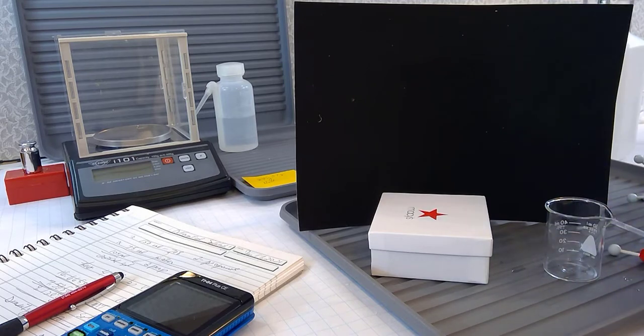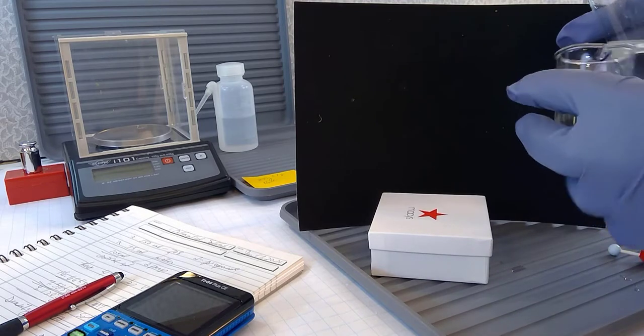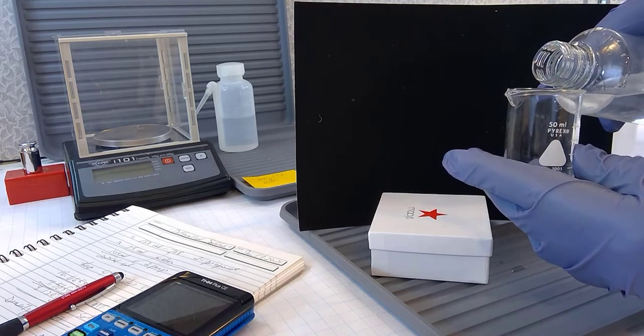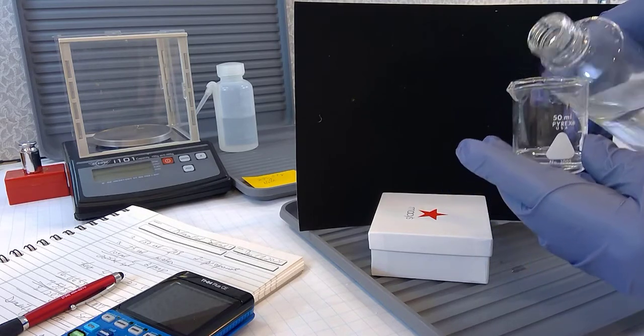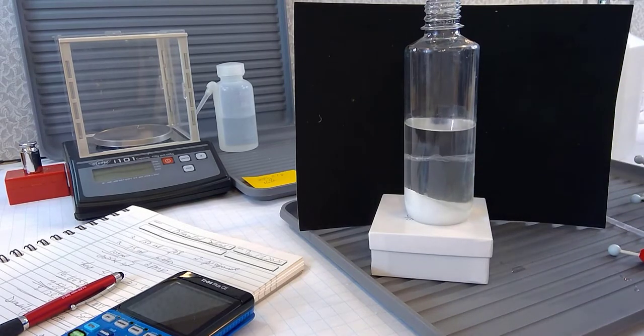So here we go. I've got this, and I'm going to try and just get about 10 mLs of that top layer out. There, I think I got 10 mLs. I'll put this back and get my graduated cylinder right here.